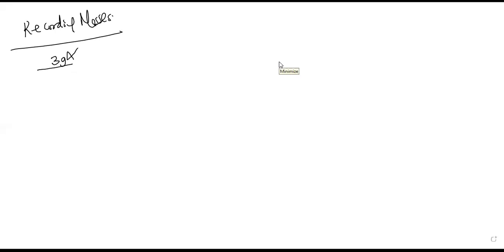Someone is asking, how about 3.0 grams? But that is 1 decimal place already. You are right, depending on the scale you are using. This is half a mark. I'm saying no decimal place. This is 1 decimal place. The moment you record 3.8, something like that, that is a very good 0.